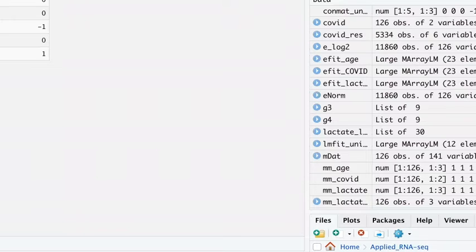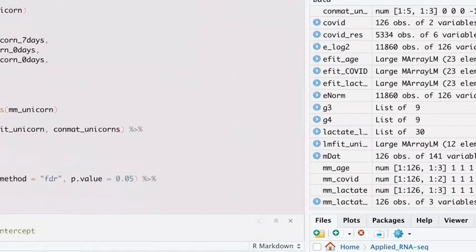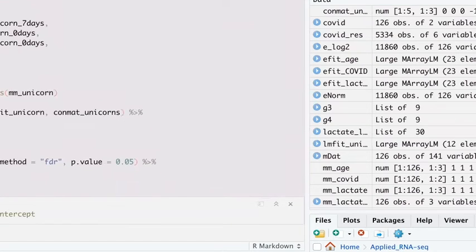It basically gives you a measurement of whether the unicorn protein is present at day 14 versus day 7, when comparing to the PDAT data frame that we have. And when you have specified the levels of unicorn here, remember that this is our actual model matrix. So you're fitting your contrast matrix to the actual model matrix that you made before.